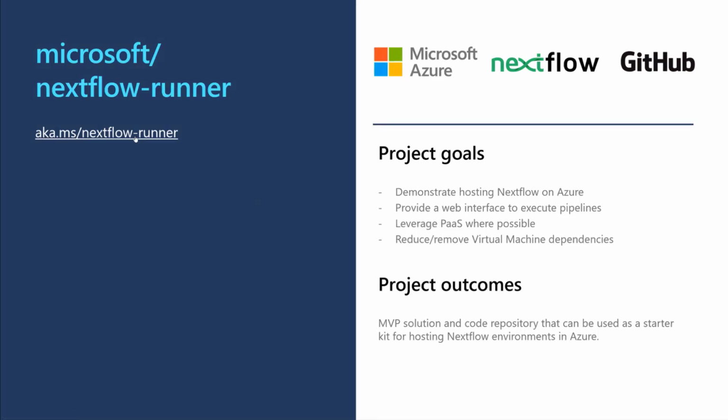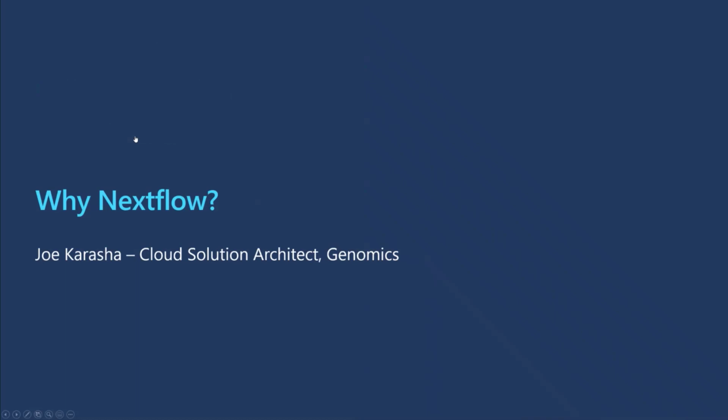So what is Nextflow? Nextflow is a workflow manager that was developed to simplify the process of building and running bioinformatic pipelines. Bioinformatic pipelines are usually very complex with many distinct steps, with each step potentially running a specialized tool or specialized process. The steps are usually dependent, and output from one step can be used as input into a secondary step.